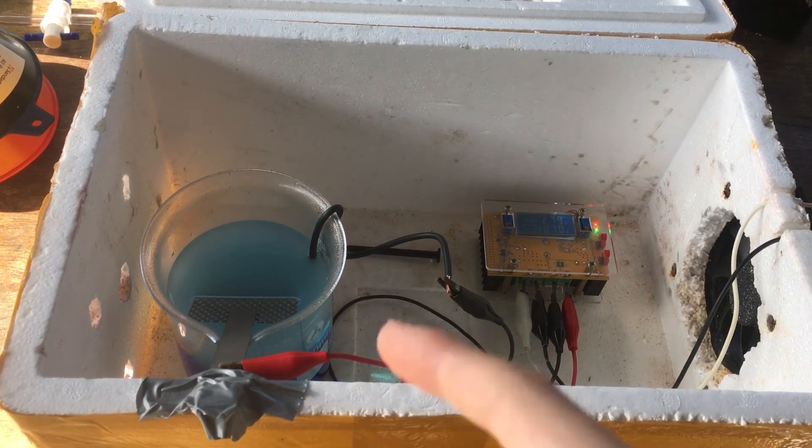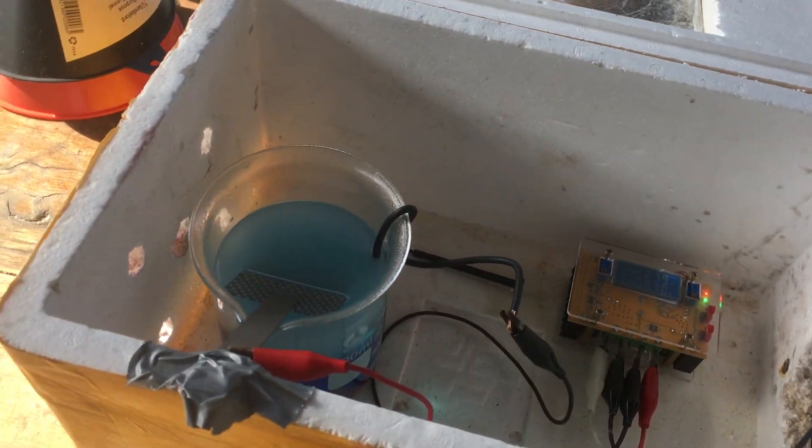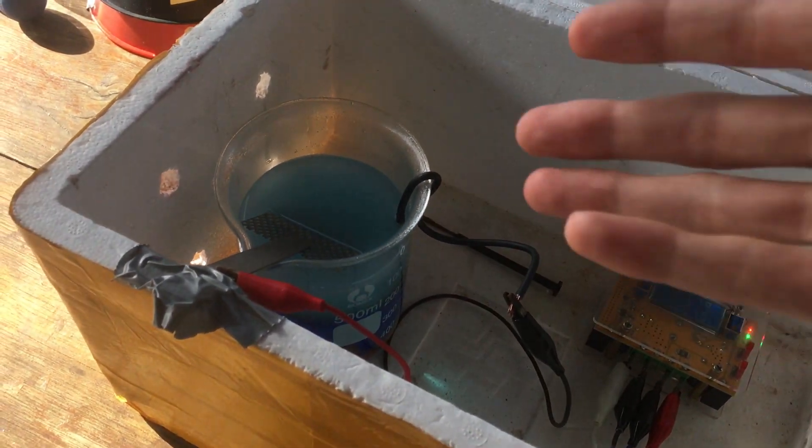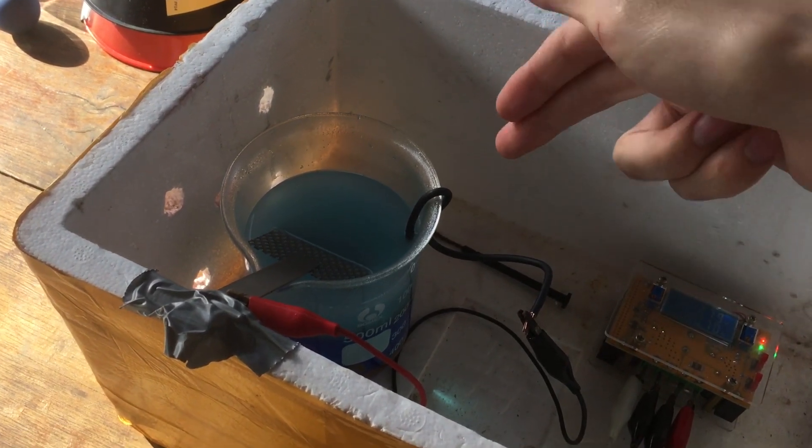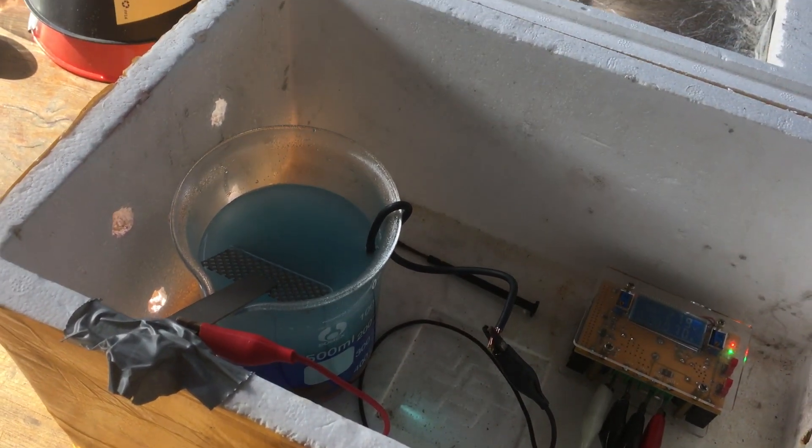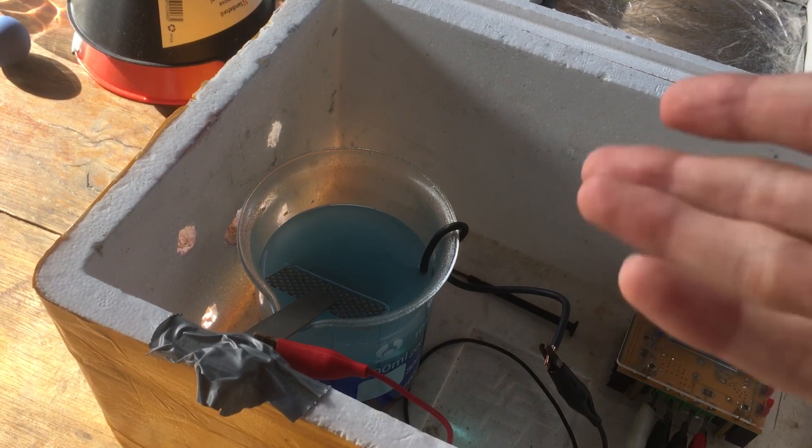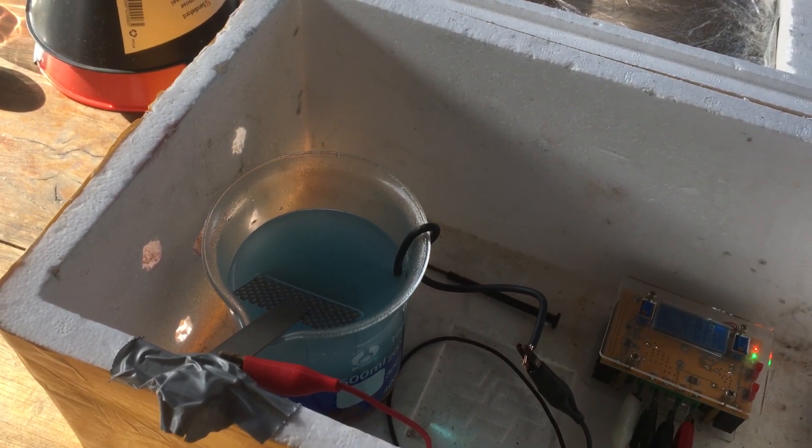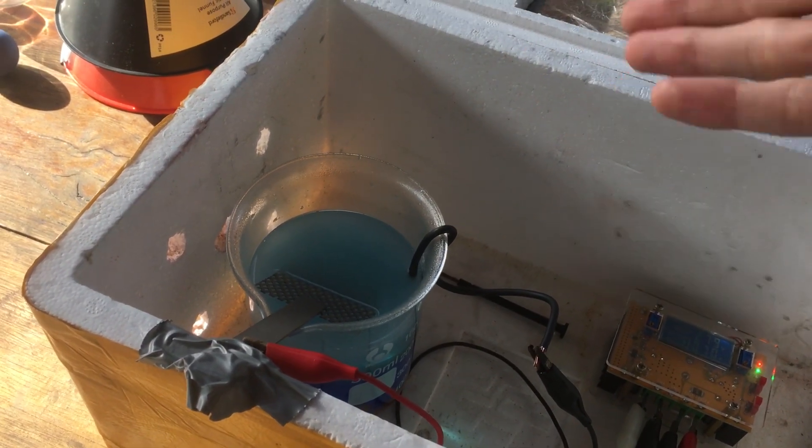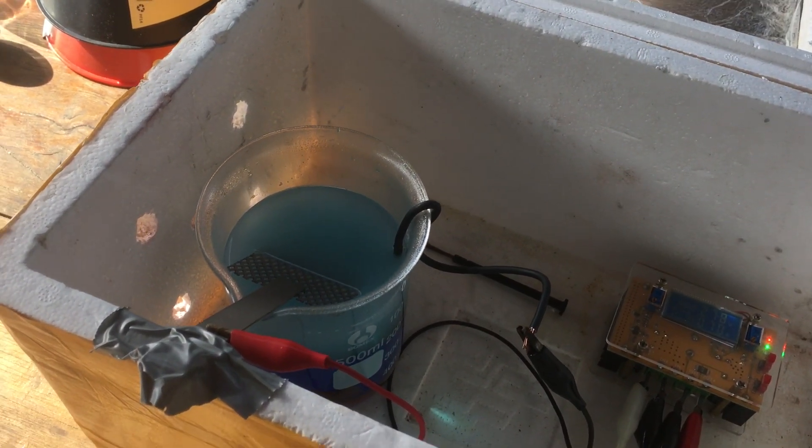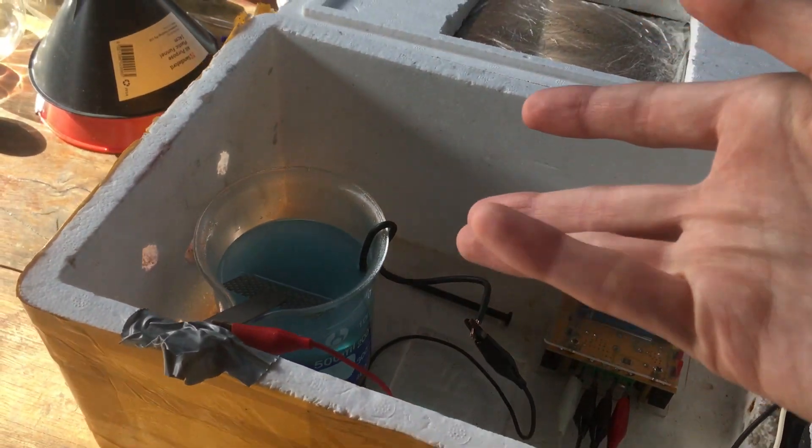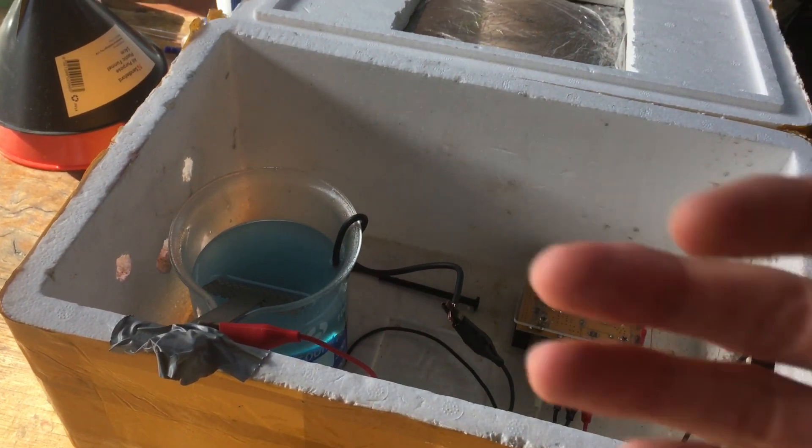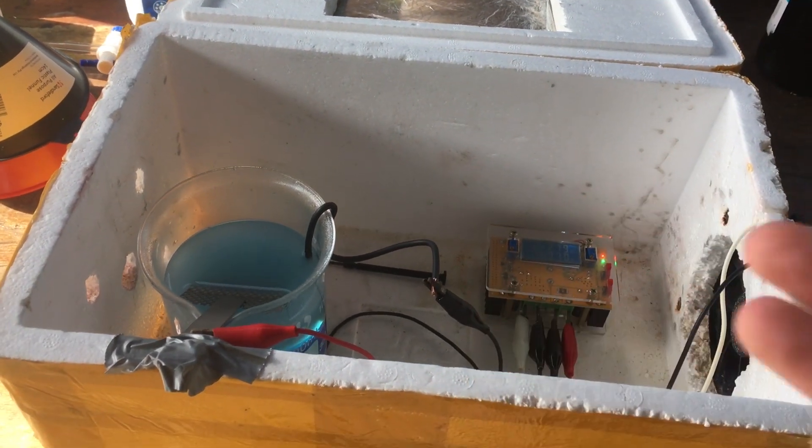Now, this electrolysis reaction is particularly easy because we can tell when it's done. The copper sulfate in solution is very, very blue. It's very obvious when you still have some left in the beaker. But once we continue electrolyzing for a long enough period of time, we'll be left with a clear solution and we'll know that that's pure sulfuric acid.